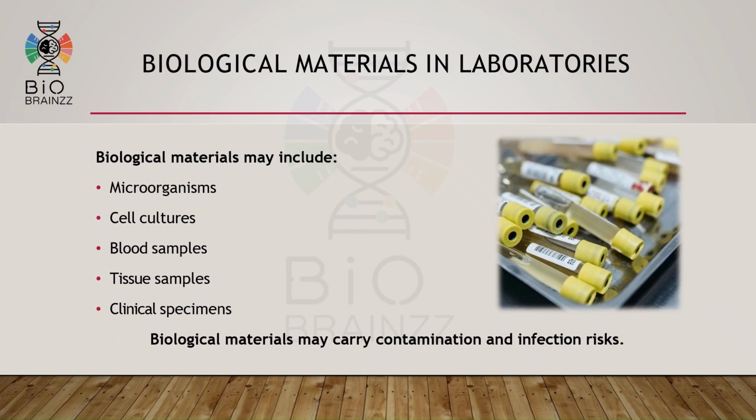Along with chemicals, laboratories also handle different biological materials. These include microorganisms, cell cultures, blood samples, tissue samples, and clinical specimens. Such materials may contain infectious agents or contamination risk. Therefore, proper biosafety practices must always be followed while handling biological samples.